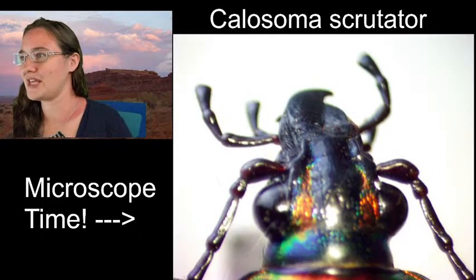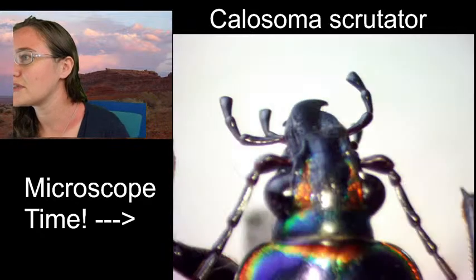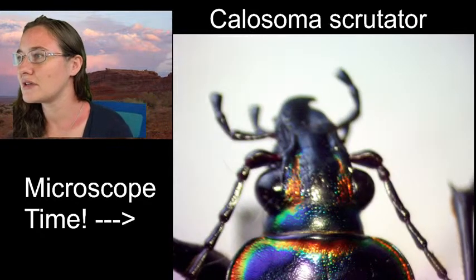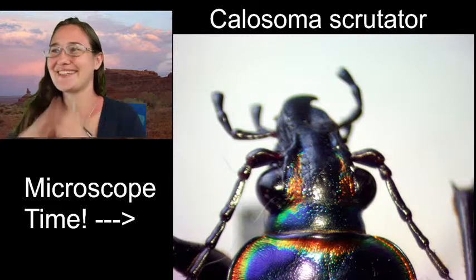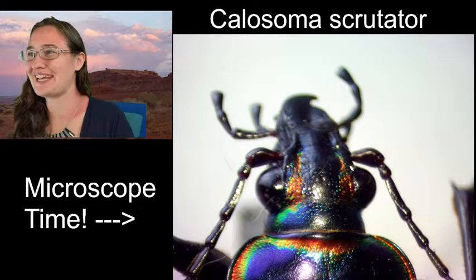Maxillary palps, labial palps. All right. It's so pretty.